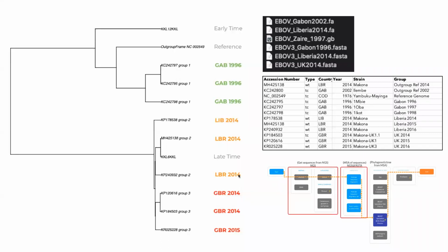All right, so a couple of you, Trinika and Maya, were able to run it. Great. Anyone else? Did anyone else have a problem running this? Okay, so some of you were not able to. Okay, so hopefully today we'll try to do this together and also check if there were any issues trying to understand every step and finding the files and making sure that we can also think about other ways to apply the same analysis to other data sets that we can find online.